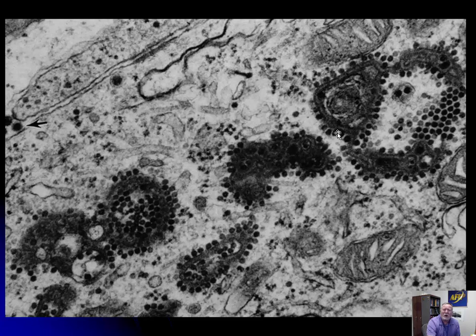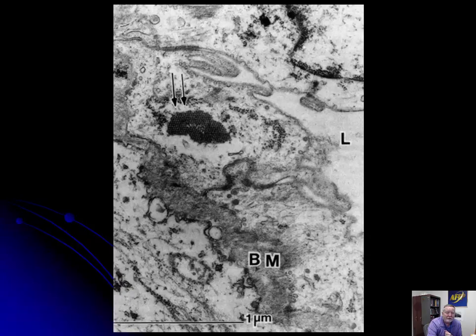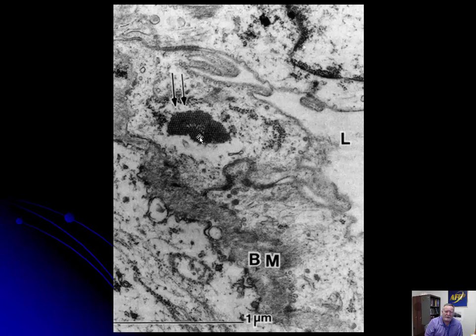Because it is proliferating in the cytoplasm, my assumption is this is an RNA virus. Here's another RNA virus — the picornavirus, meaning very small. Luckily, picornavirus is an RNA virus because out in the cytoplasm it's visible. They proliferate in paracrystalline arrays; otherwise we probably never would have discovered this virus back in the 1950s and 60s. This particular patch of virus is in an endothelial cell of a baboon infected with encephalomyocarditis — a disease that in most animal species, except rodents, affects the cardiovascular system.